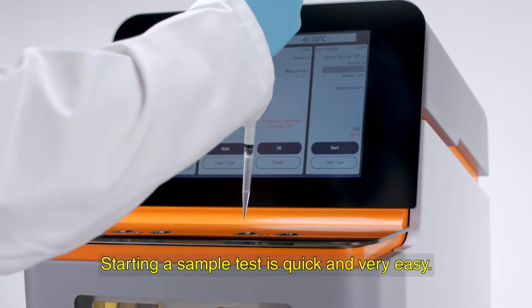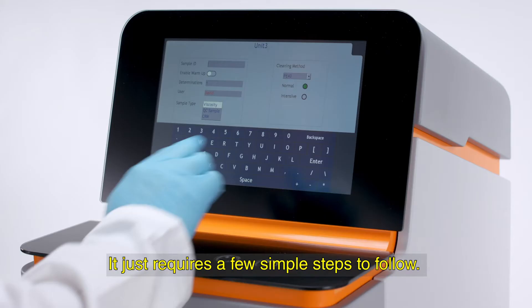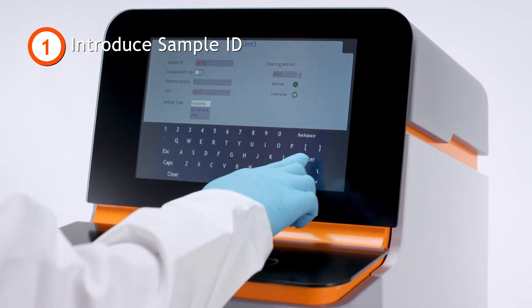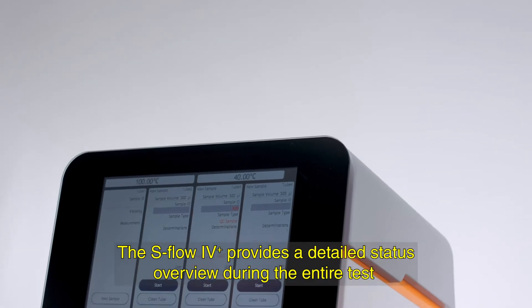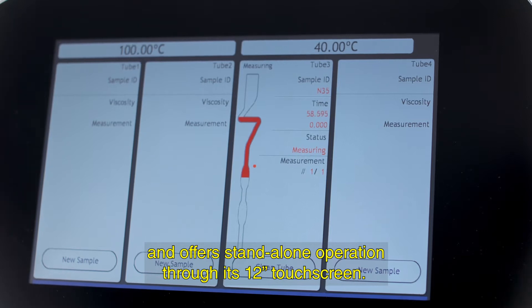Starting a sample test is quick and very easy — it just requires a few simple steps to follow. The S-Flow 4 Plus provides a detailed status overview during the entire test and offers standalone operation through its 12-inch touchscreen.